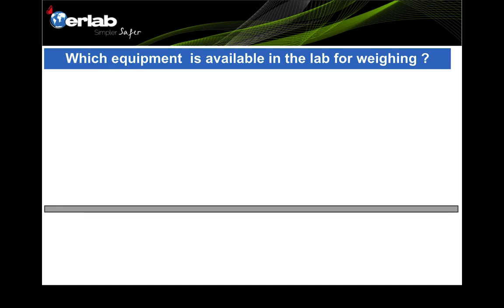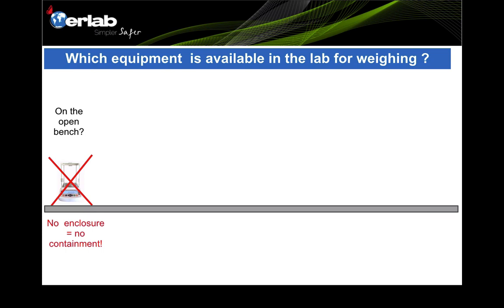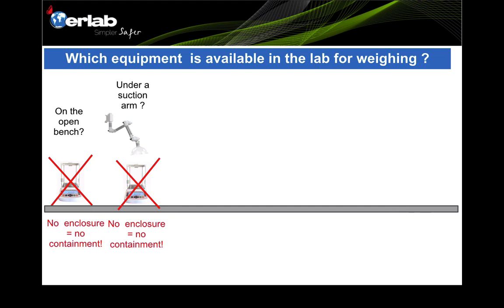Now we're going to see which equipment is available for the laboratory while the operator is doing weighing, especially with toxic hazardous powder. The first very common situation is doing measurements on the open bench — no enclosure, no containment, and no safety. The second common situation is under a suction arm — also no enclosure, no containment. The powder can escape from the balance and be inhaled by operators, so there is no safety either.